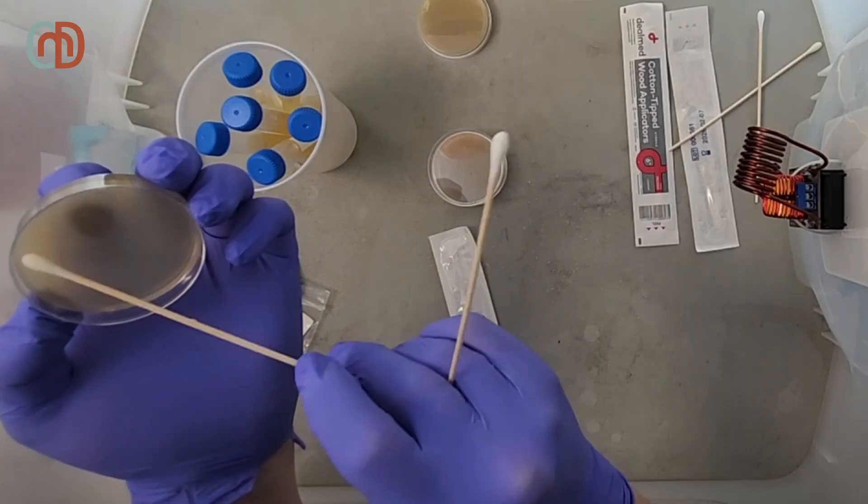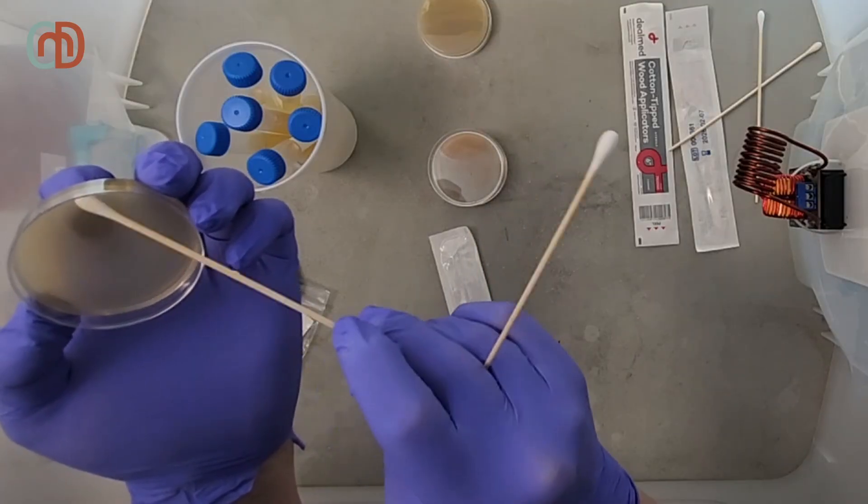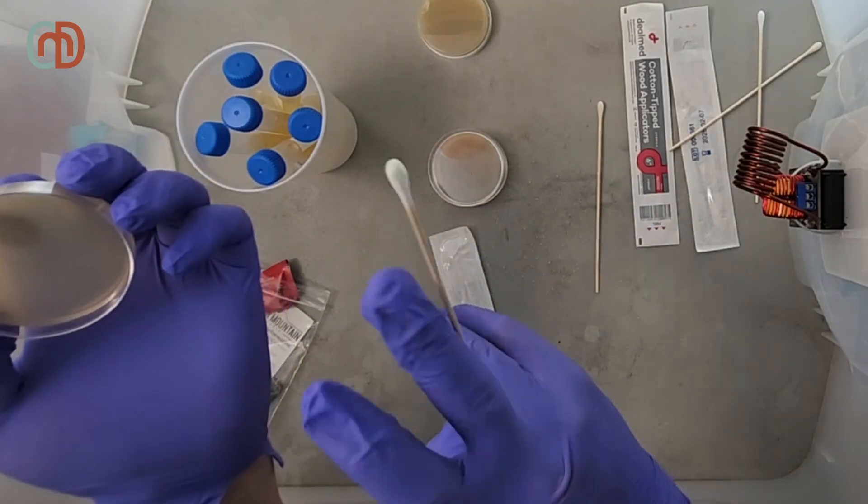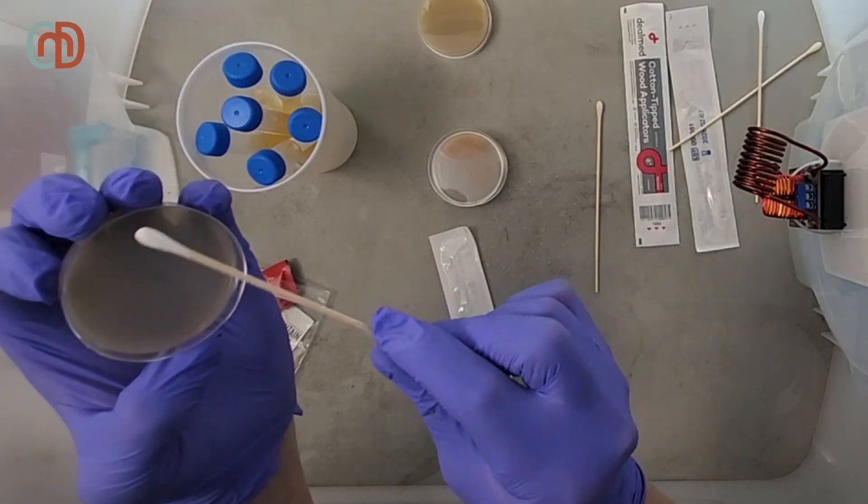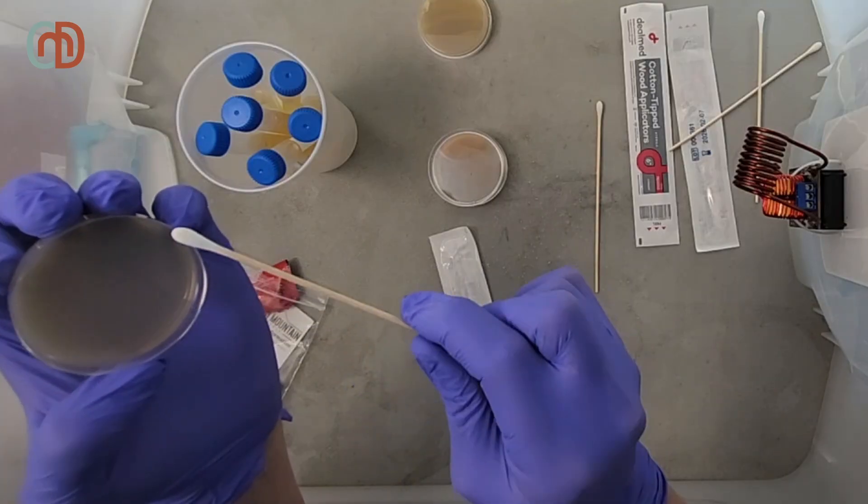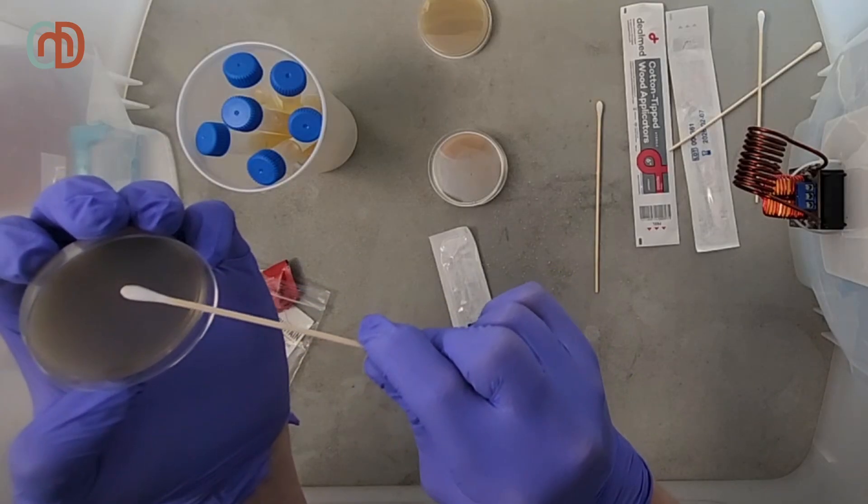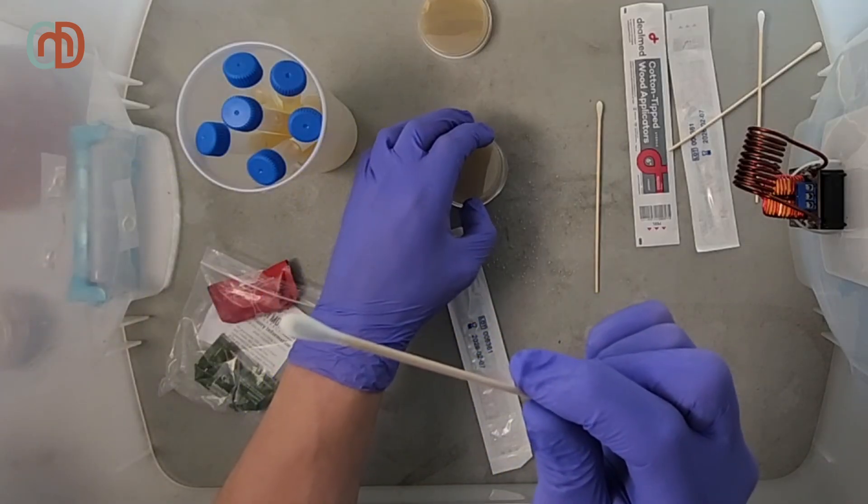What this does is it isolates individual cells by slowly diluting them over the streaks. I start by making a dense area of cells. Then taking another swab, I grab a few of them from that area and create a less dense area of cells. Then rotating the swab, I grab a little bit out of that area and create an even less dense area of cells.